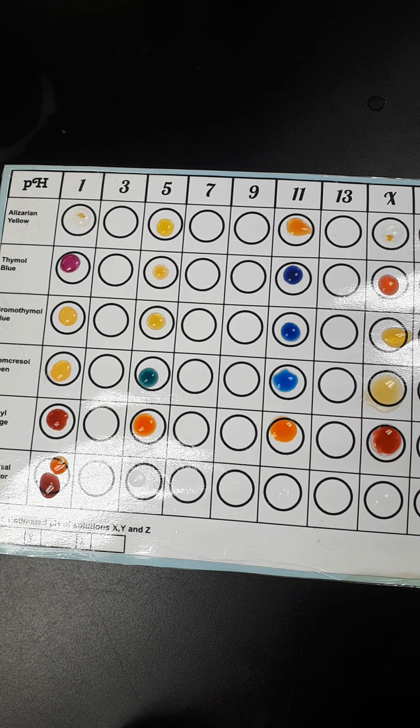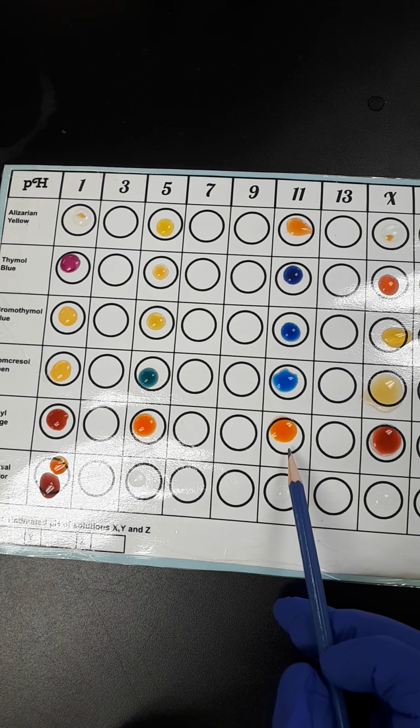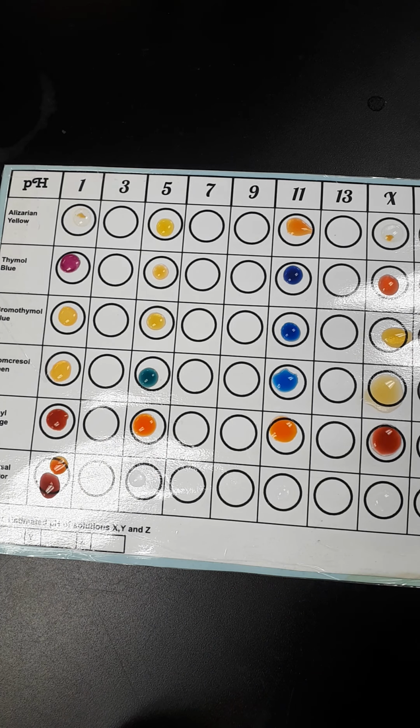And then with whatever X is, definitely red. So most definitely red. That one's a little bit harder for me to see with each of those, right? But if it's red, that means pH has to be less than 3.2. So again, summarizing that, 3.2.